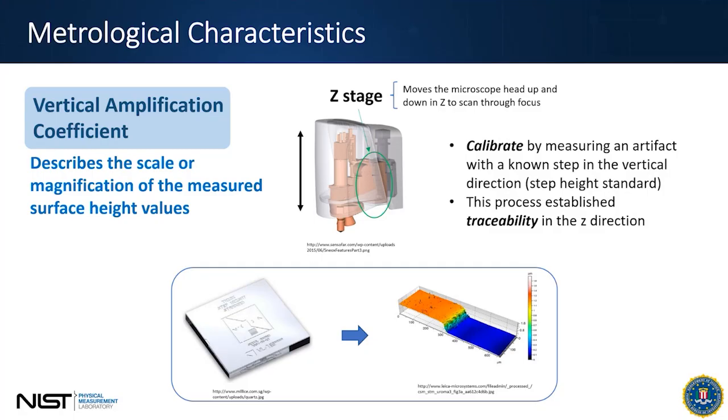But not all of them do. So there's ways around to how to check and verify that this works. And again, this is something that should be part of the acceptance criteria when you're evaluating these instruments, that the vendors demonstrate to you, yes, here's some data that shows that my Z is correct.